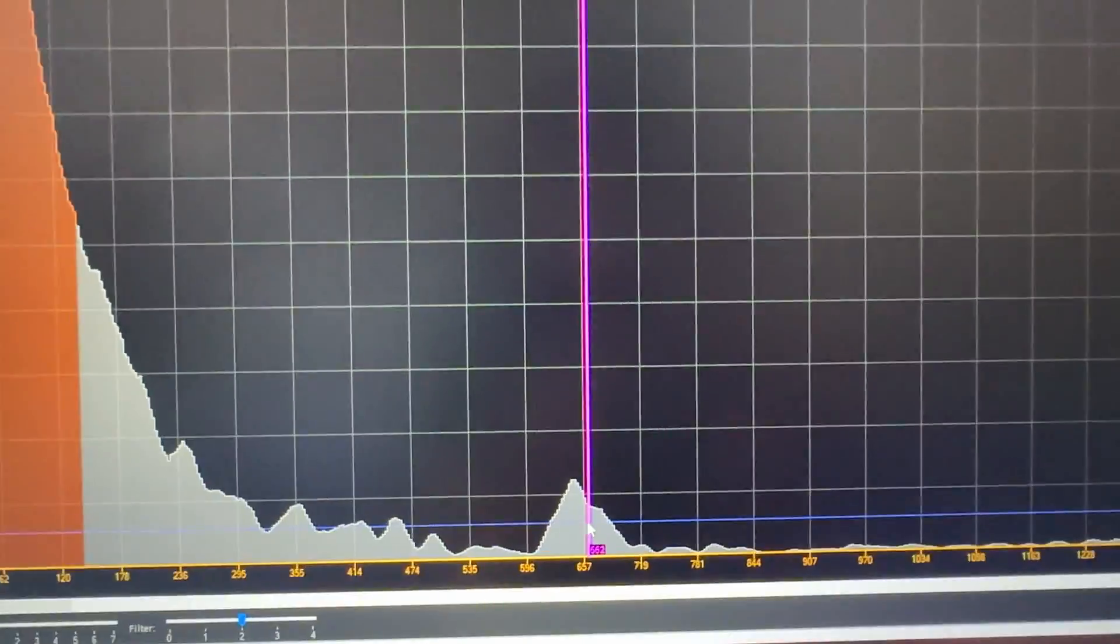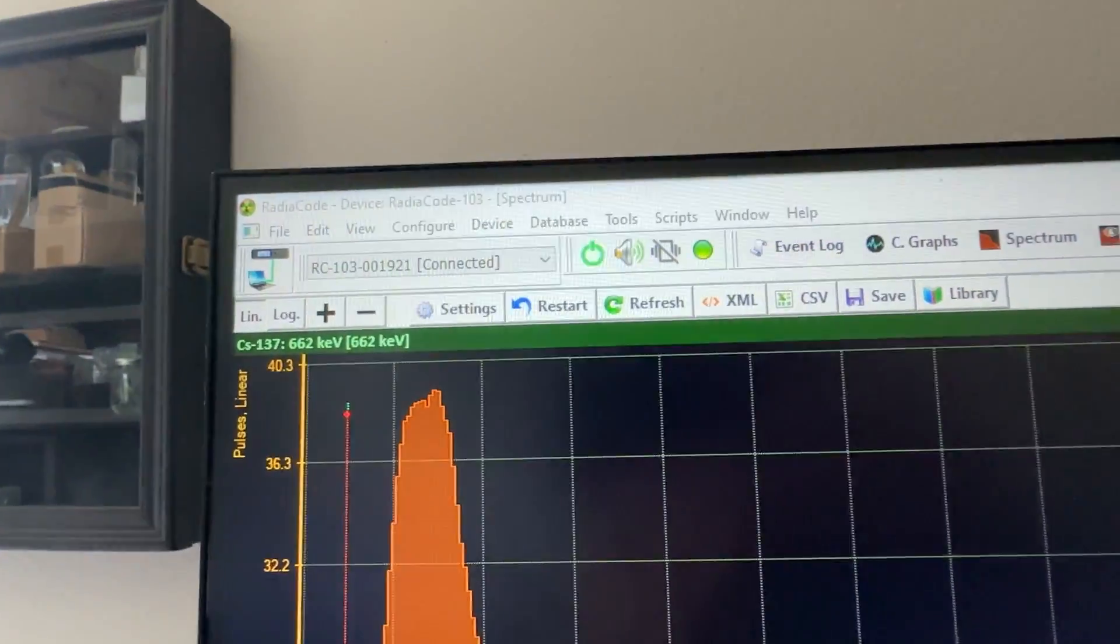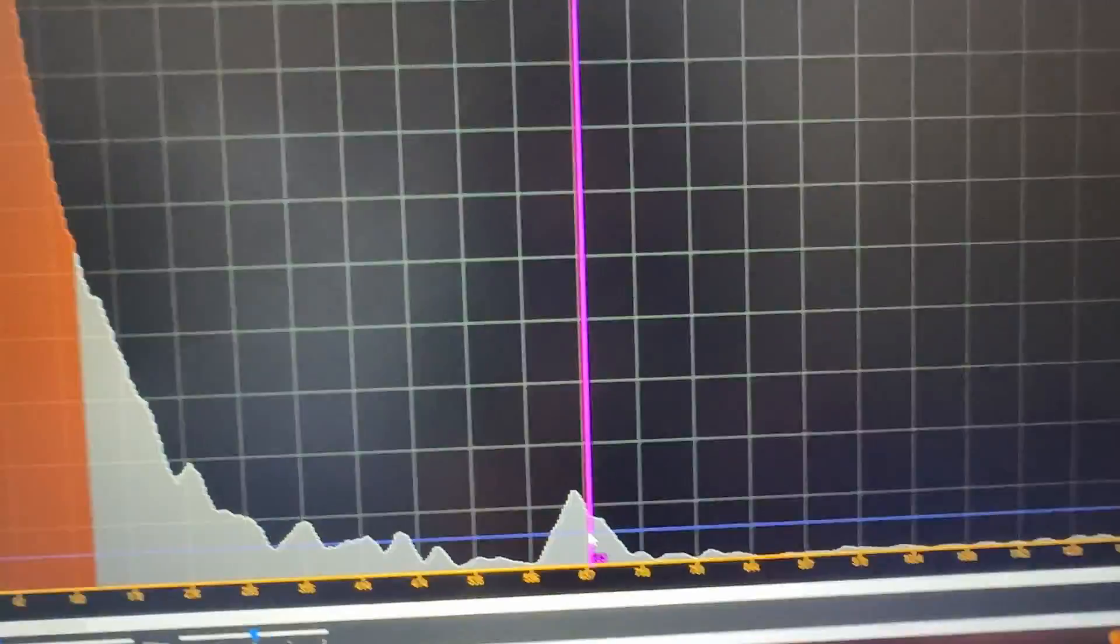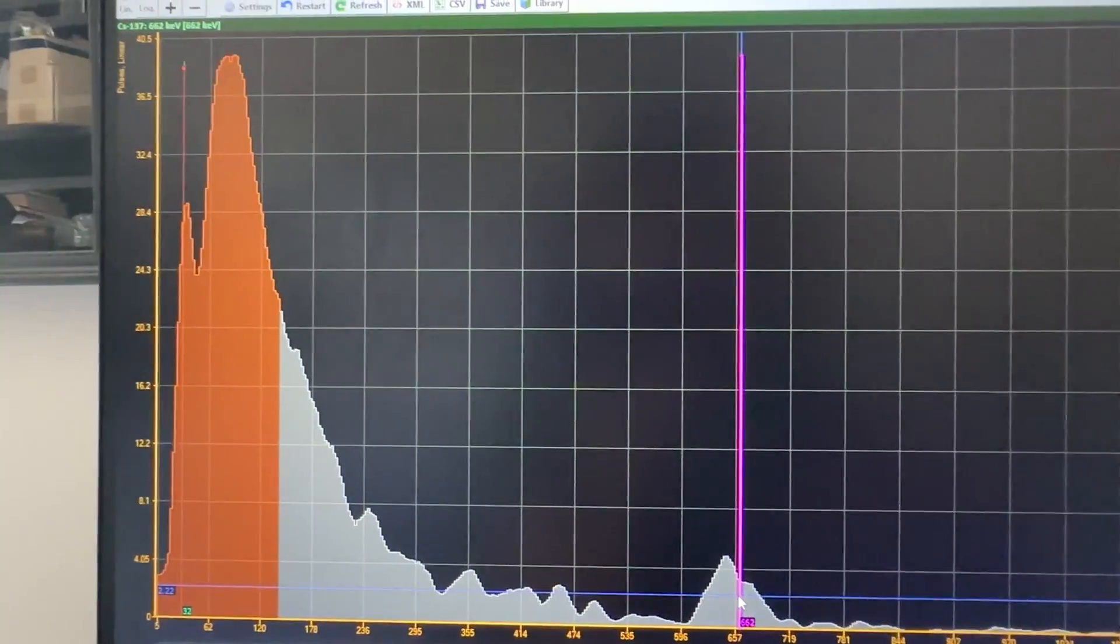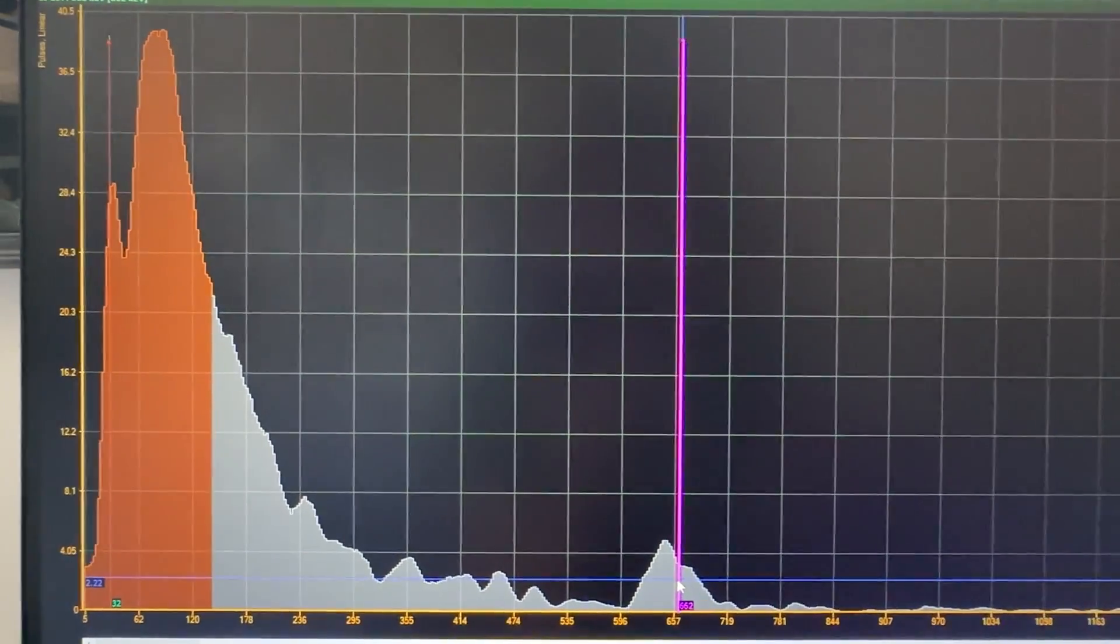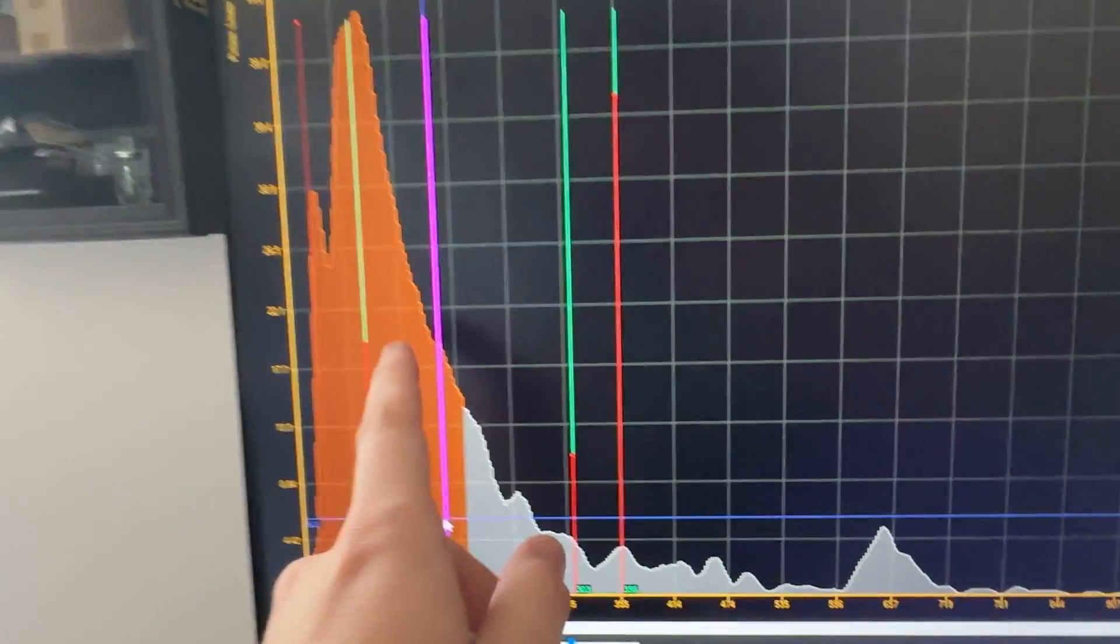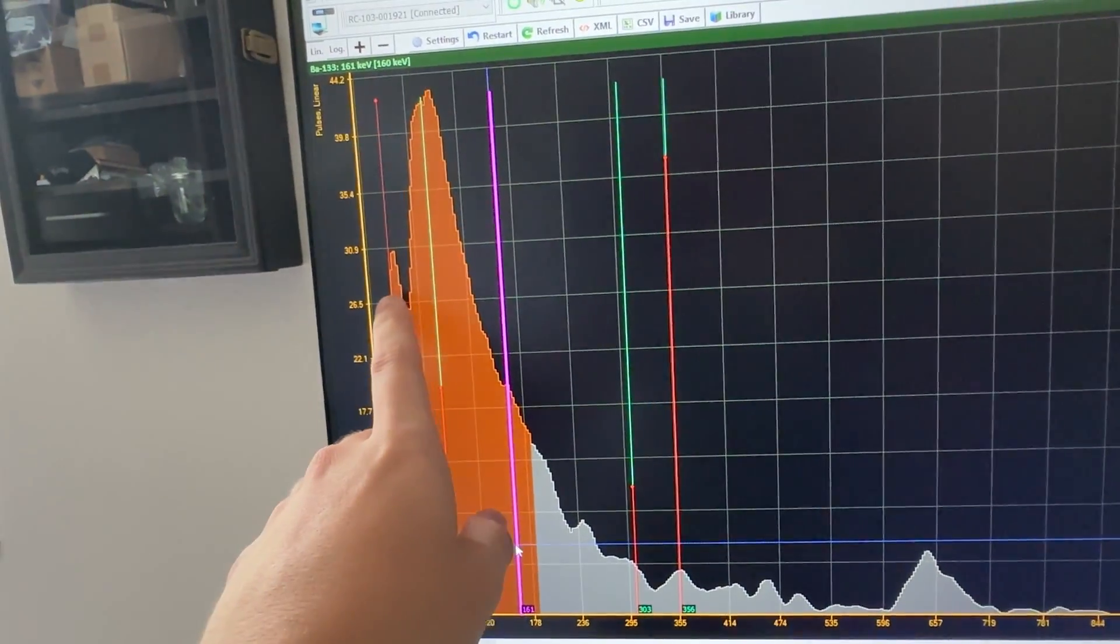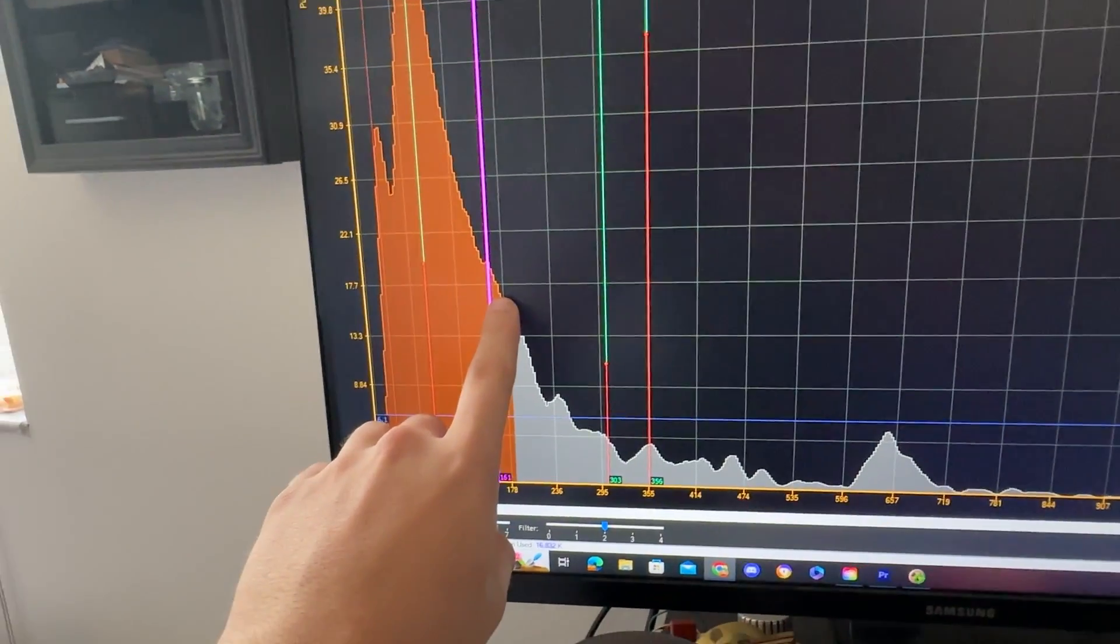Over a period of 15 minutes you can clearly see that we have cesium-137 in our sample. And this is due to the radioactive fallout of Chernobyl. And since cesium-137 has a half-life of I believe about 30 years it can clearly still be detected. So it's pretty awesome that we are still detecting the radioactive isotopes from the Chernobyl explosion.